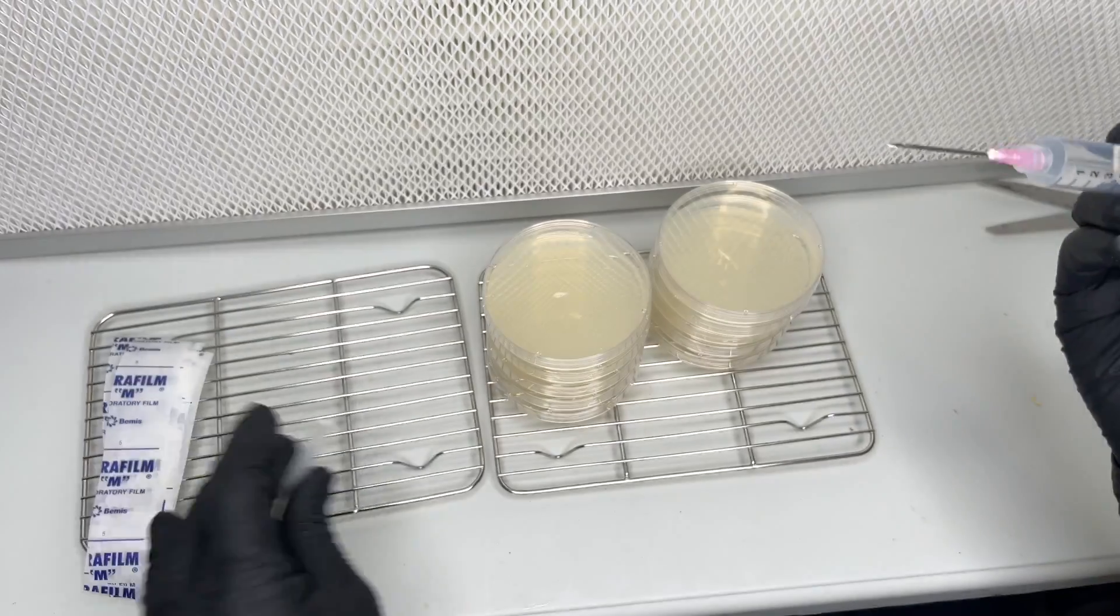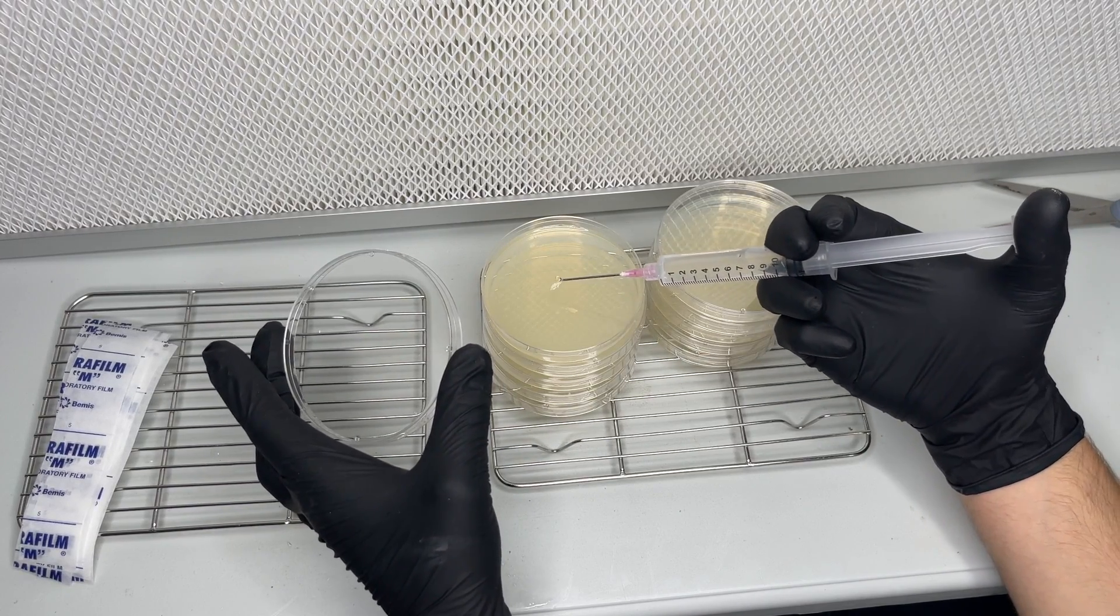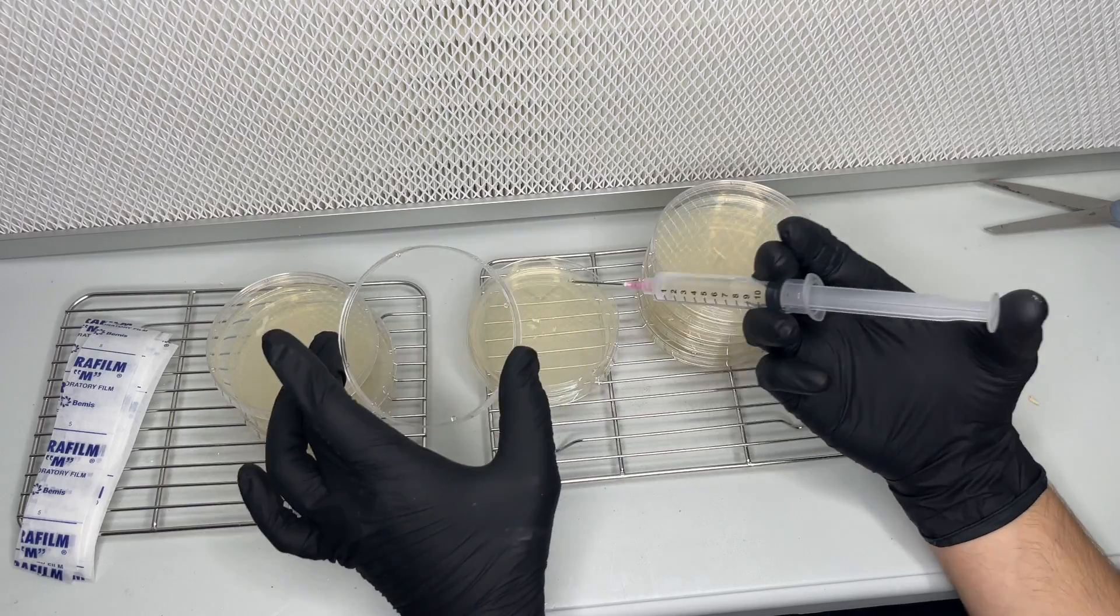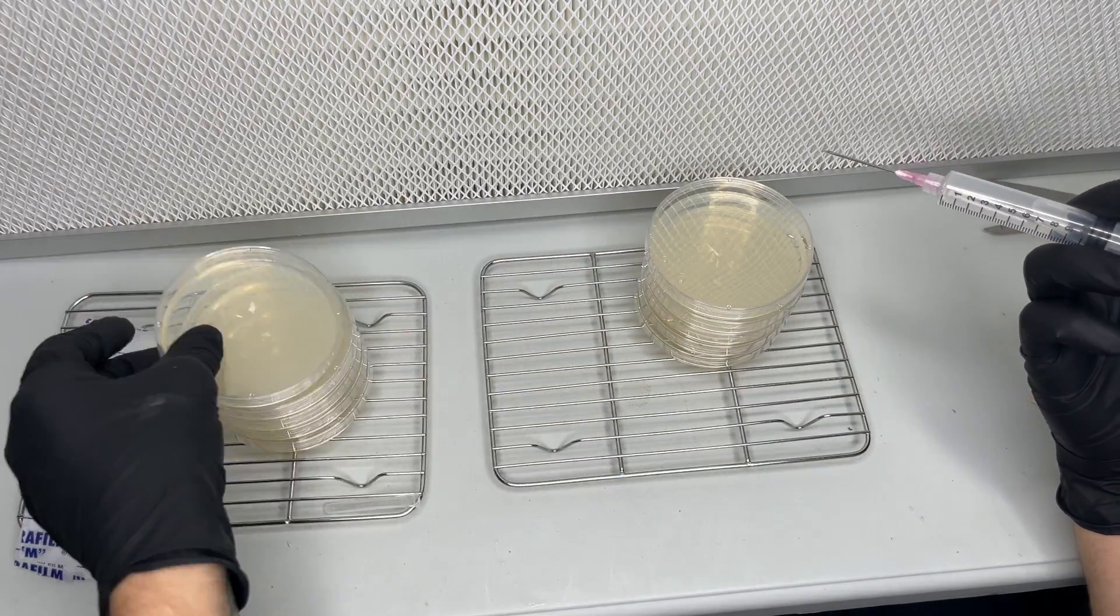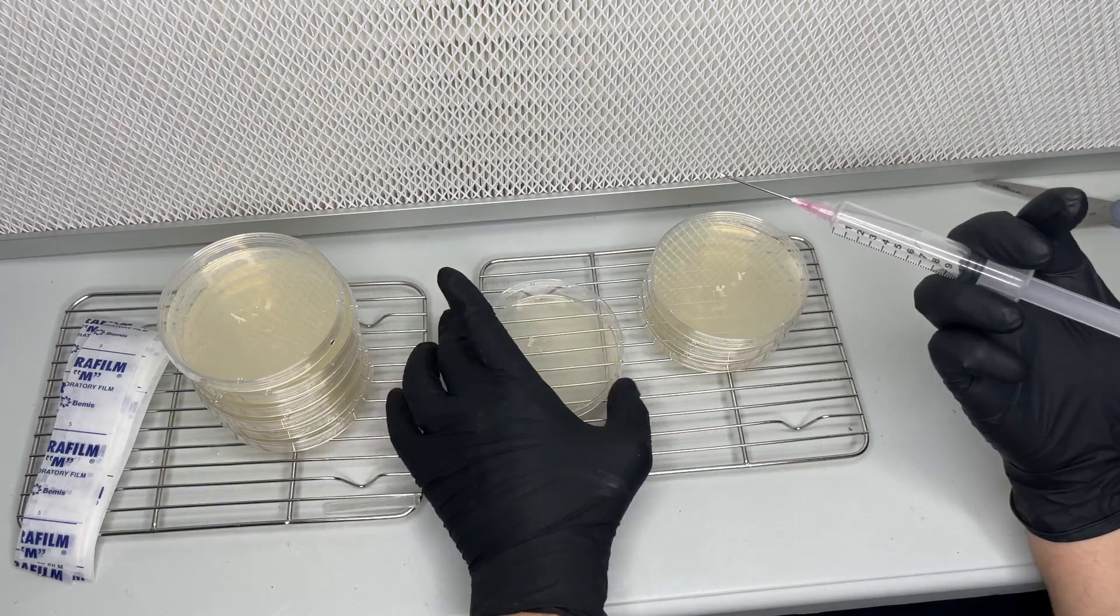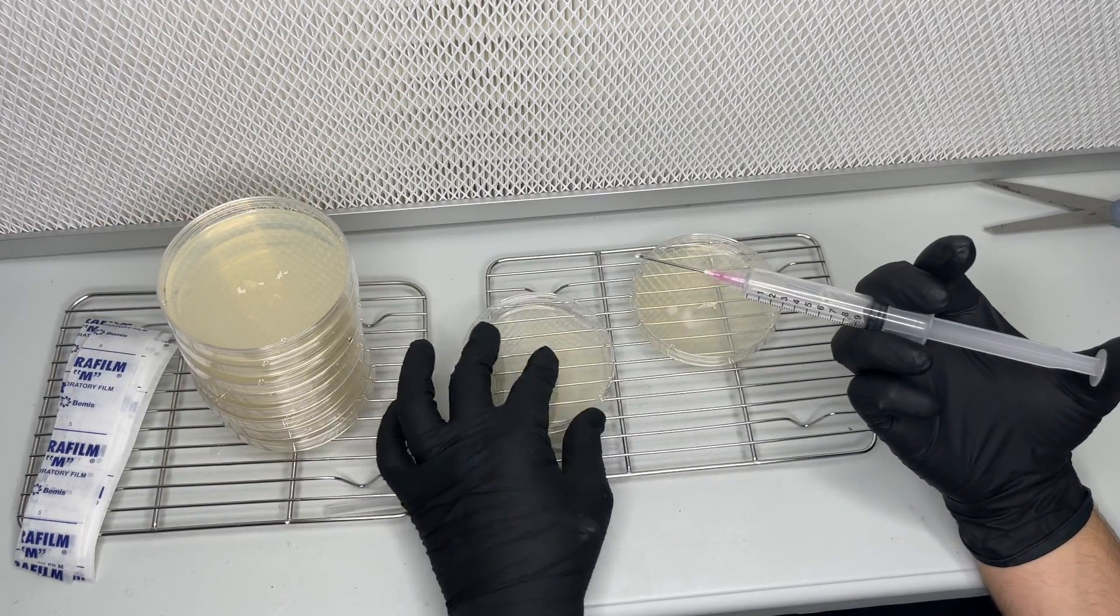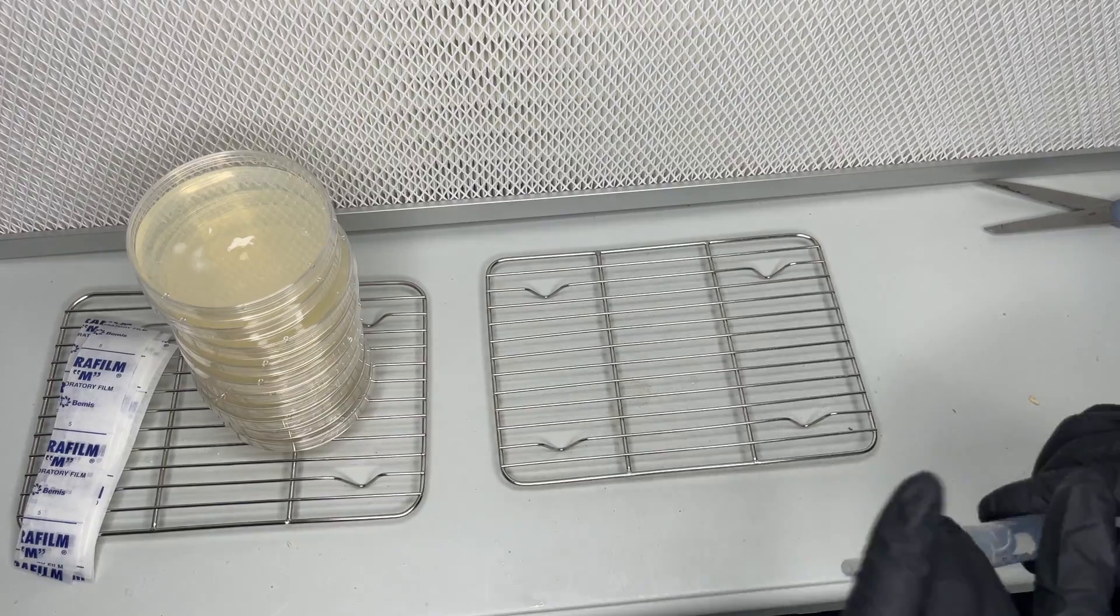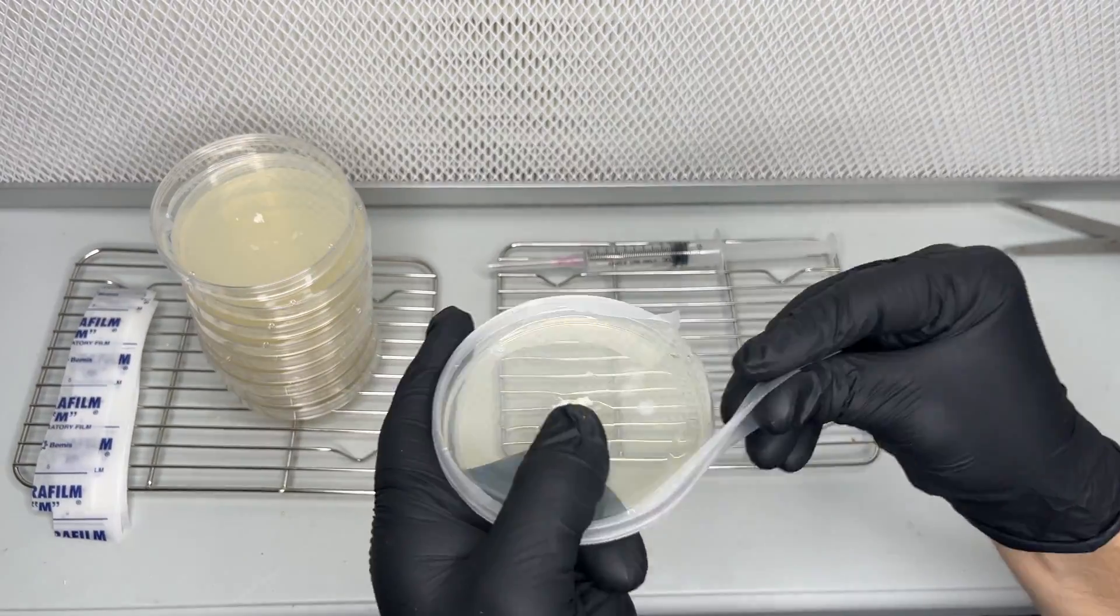After I was finished taking the transfers, I added a few drops of the sterile water to each of the plates. I wrapped each plate in parafilm and allowed them to incubate at 75 degrees Fahrenheit for two weeks.